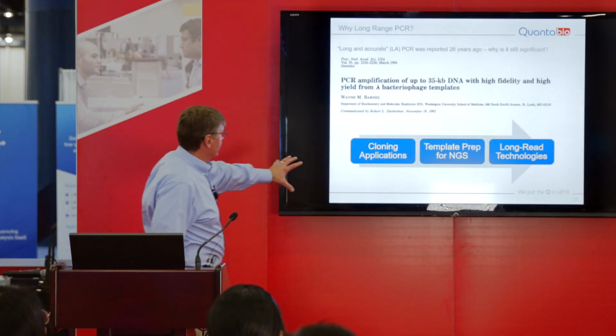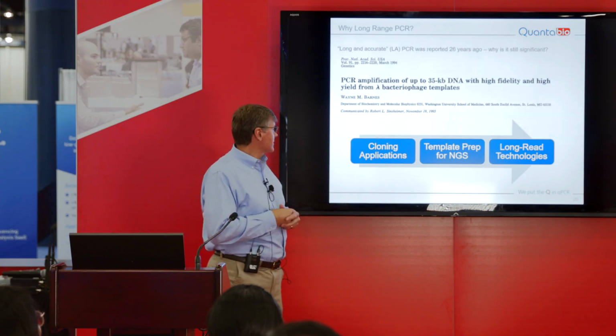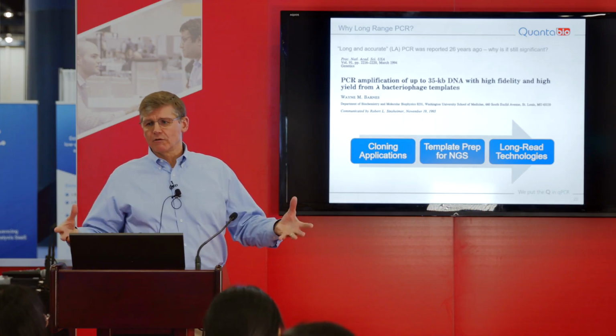But Wayne reported this, and why was it important and why is it still relevant? In the old days, people were trying to clone products, and so they were trying to characterize based on cloning. Now everything's moving into NGS workflows, whether that is taking the longer products, fragmenting those, and sequencing on Illumina, or using the longer products to feed workflows directly into long-read platforms like PacBio. So there are emerging needs, and I think some of the older technologies that we've been working to improve upon still have a very firm place as a research tool today.